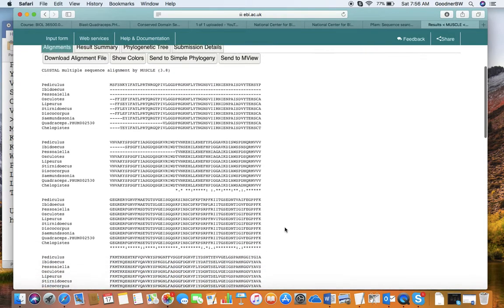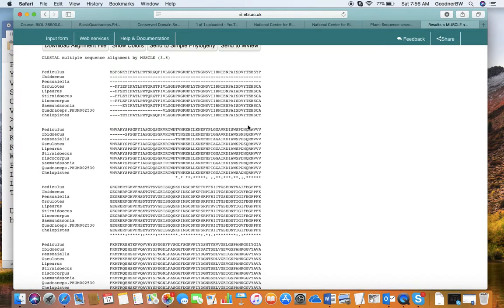So here's the best alignment it can find, and right away you can tell it's done a really good job. Look at this conservation here. Now, where you see dashes, that means a part of a protein isn't present. There's nothing to line up there, so it puts a dash in because it has to go from the start to the finish. So here's the largest sequence, and these guys don't have this out here, right? And some of these sequences are obviously incomplete.